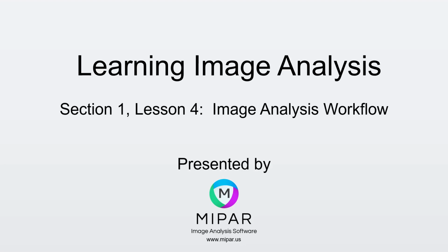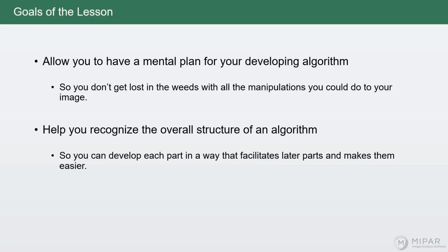We'll be talking today about how to go about developing an algorithm. We'll be reviewing a lot of what the purpose of the different steps of an image analysis algorithm are, so that you can be prepared as you approach the process of developing that algorithm.